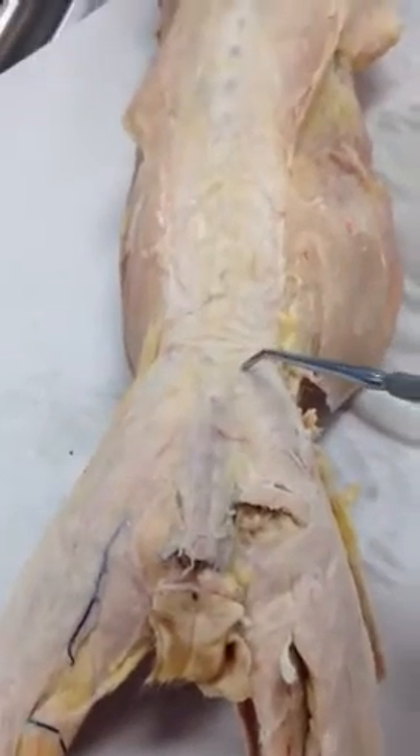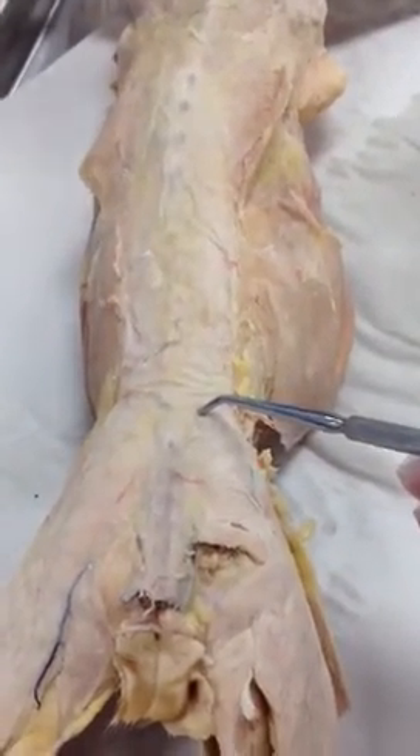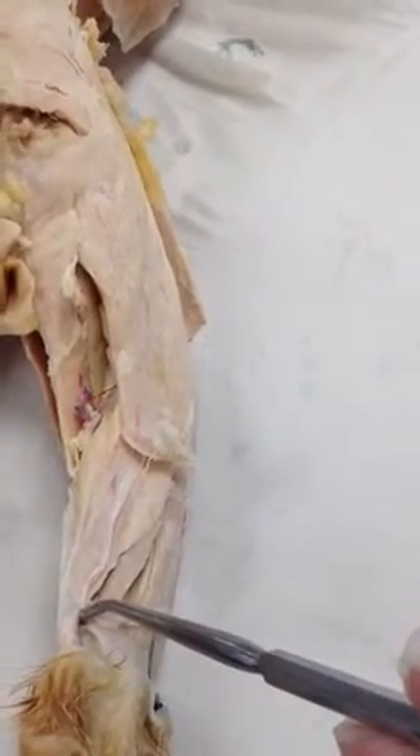And if I turn our friend over, on the back we have the lumbodorsal fascia. This tendon that we talked about earlier, this connective tissue here, is the gastrocnemius tendon.